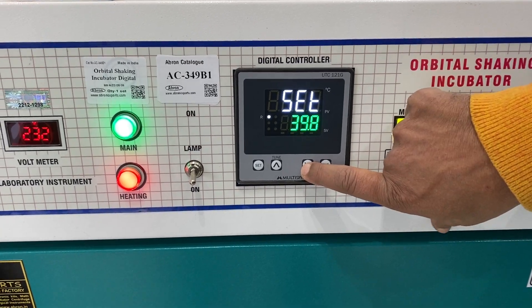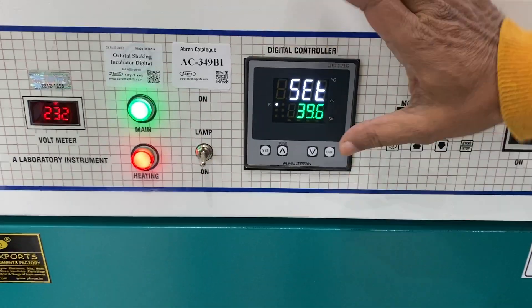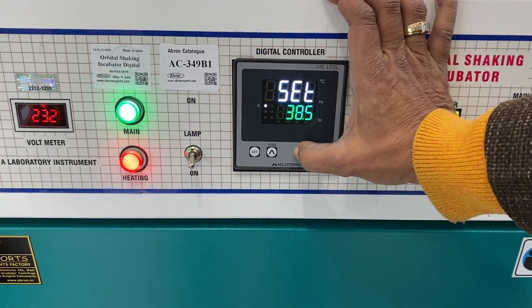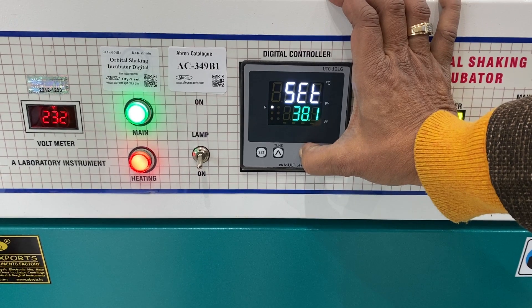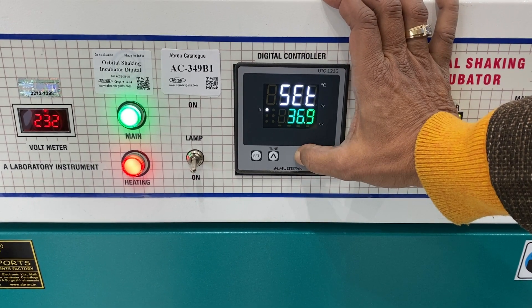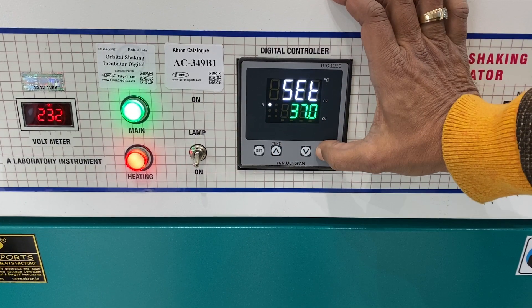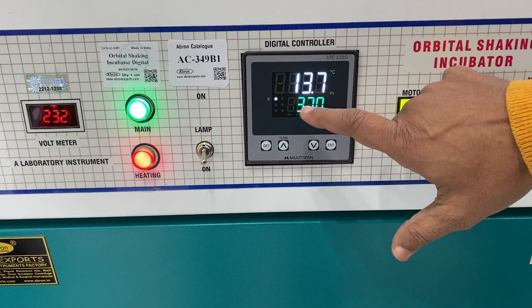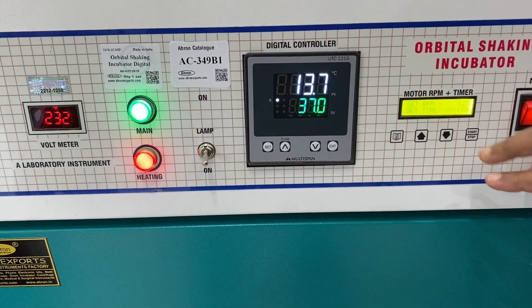Generally, most temperature cultures are done at either 20 degrees, 27 degrees, or 37 degrees. Mostly incubation is done at 37 degrees. Let me put it on 37 again and set it. This shows the inside temperature at present, and this shows the temperature we have set.